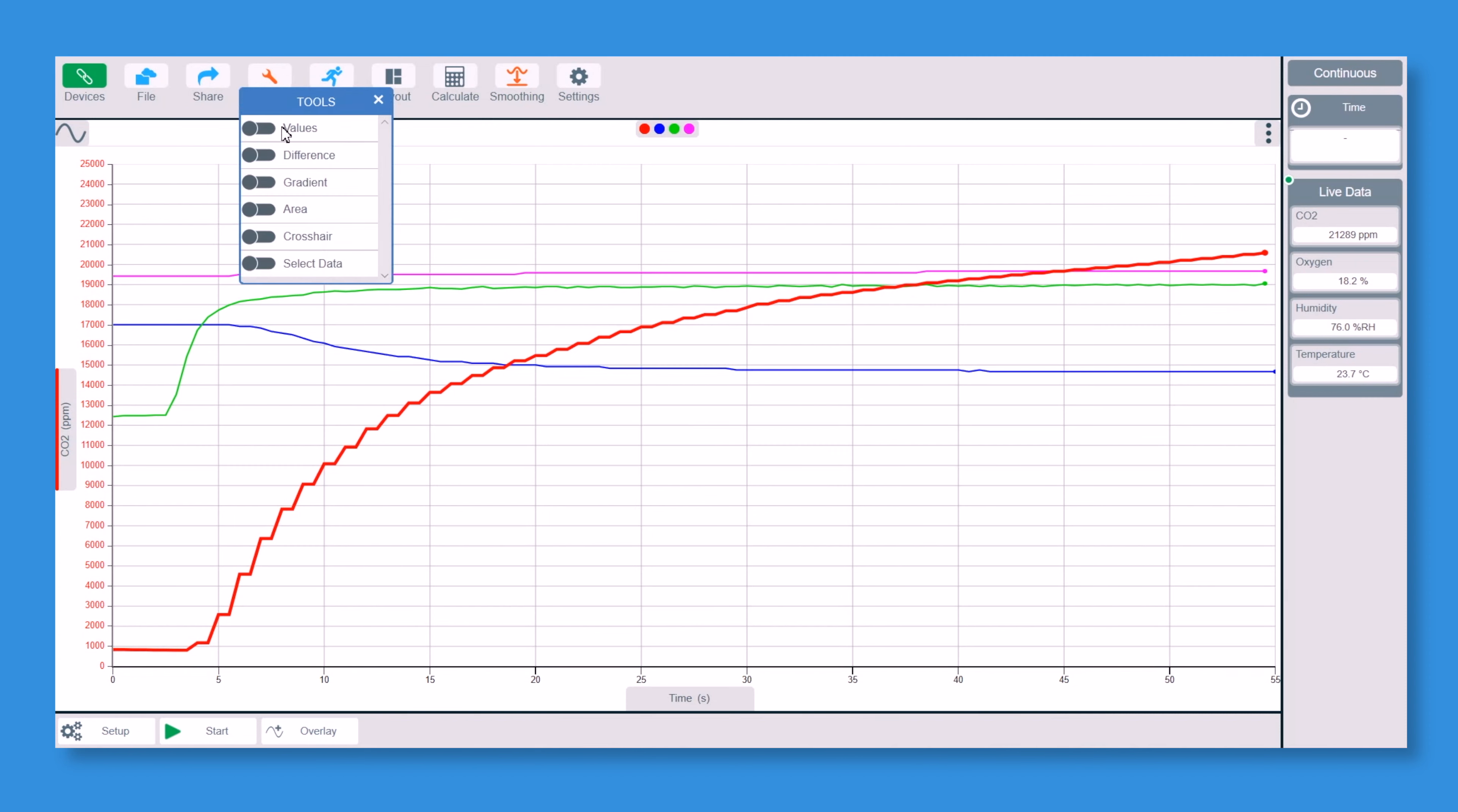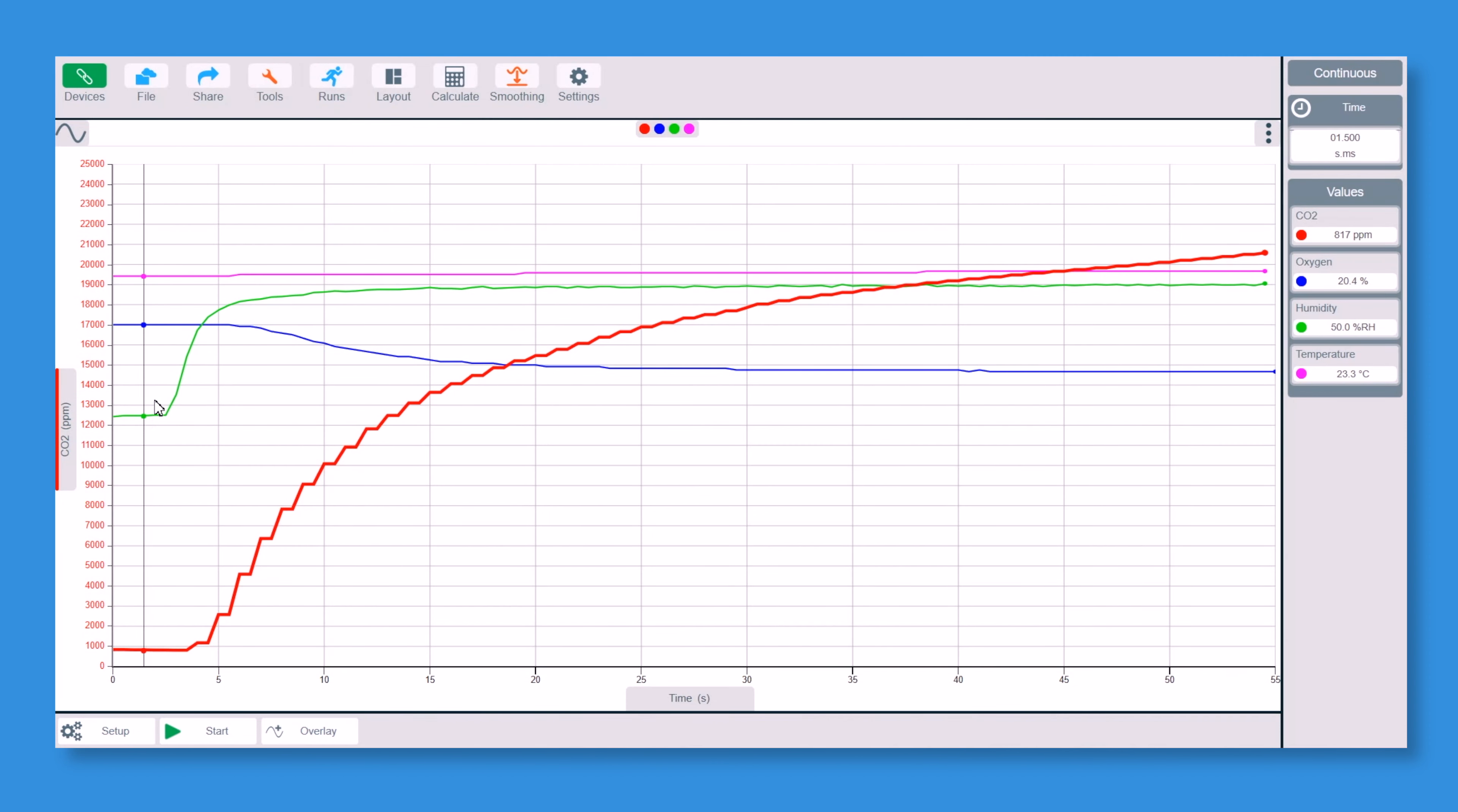If I now go to tools and go to values, we can start over here and we can see temperature was 23.3 to start, oxygen was 20.4, so slightly below, but that's okay. Humidity was 49.9 and CO2 was 827 parts per million.